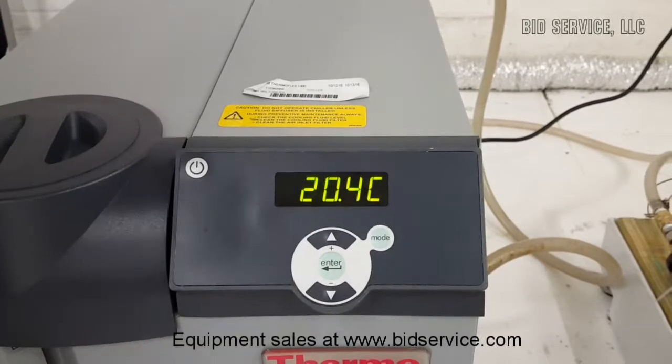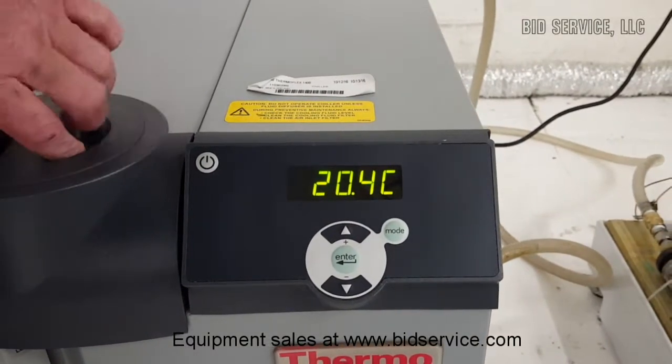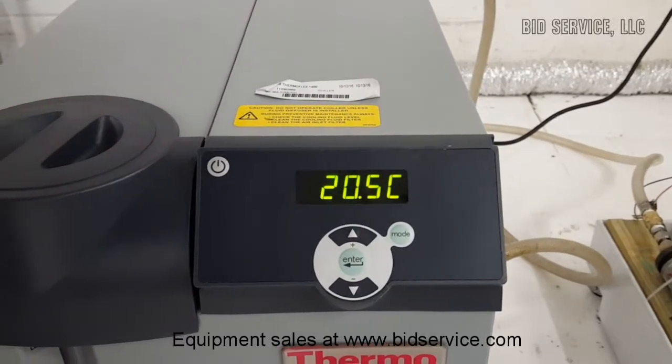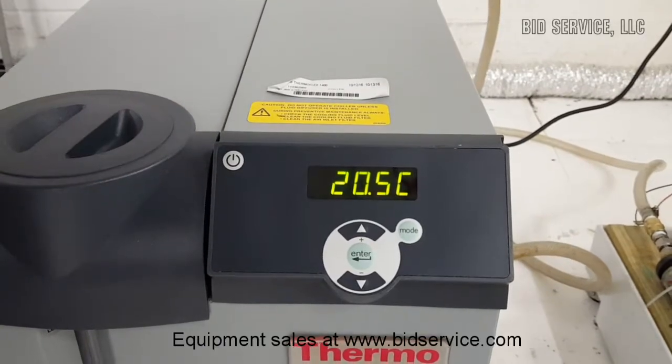It's been about one hour and it's holding pretty well. It's about 20 and a half degrees, so it's gone up about a half a degree in an hour with the 1,400-watt load.